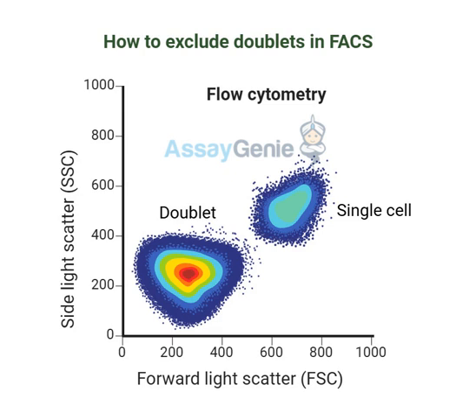So we've got these sneaky doublets trying to blend in. And scientists are using these high-tech gates to sort them out. You mentioned there's a step-by-step guide in the article for this whole gating process. Can you walk me through how that works? Of course. It's basically a series of steps, each one designed to catch a different kind of doublet. So like a multi-level security system.